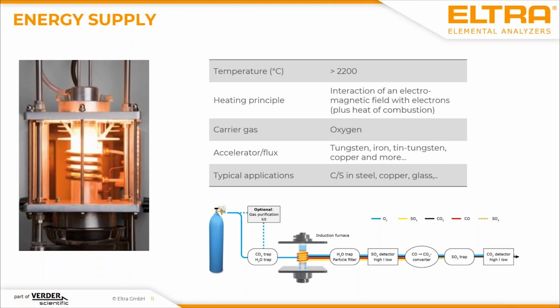You have a magnetic field which changes direction very quickly, plus minus, plus minus, and due to this, the magnetic particles inside your metal start to move, and with this you get heat inside. With this induction furnace, you get a very high temperature inside the sample very quickly, and when switching off, the energy is off completely. So you have a very quick cool down process.